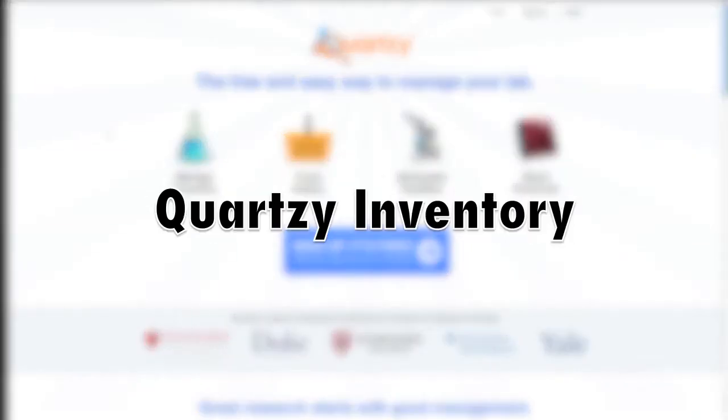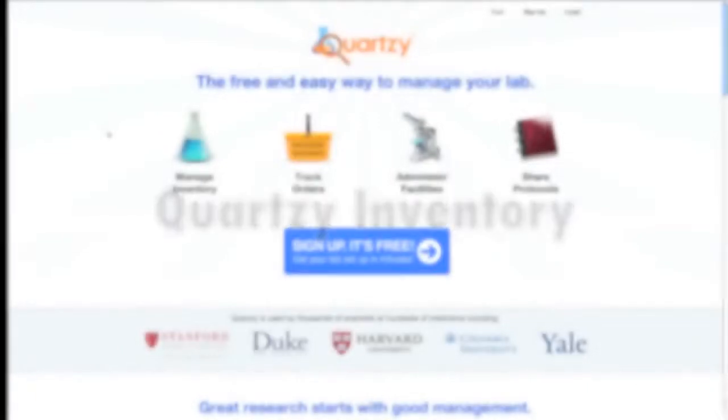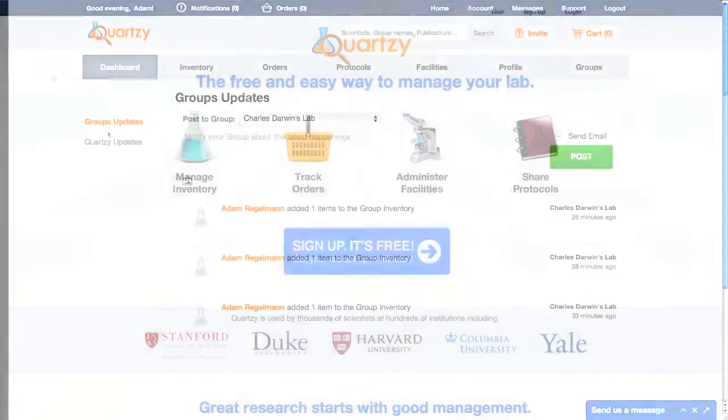This is Adam Regelman again, one of Quartzy's co-founders, and this video is going to focus on Quartzy's inventory module.